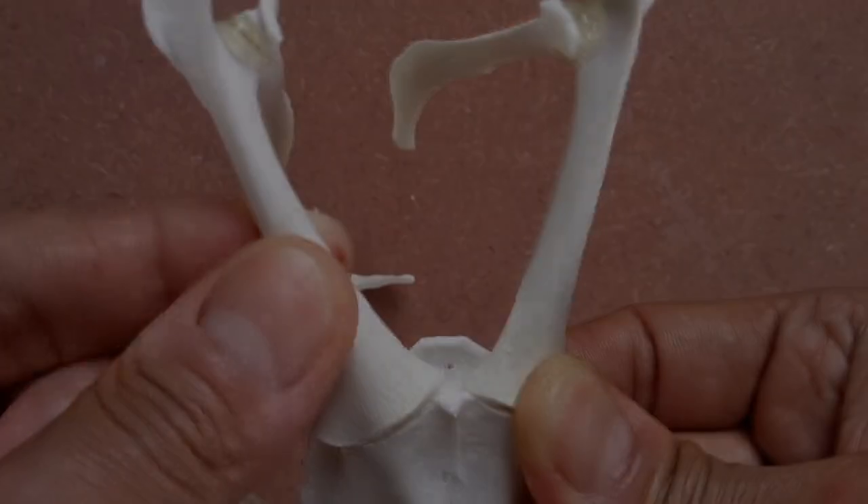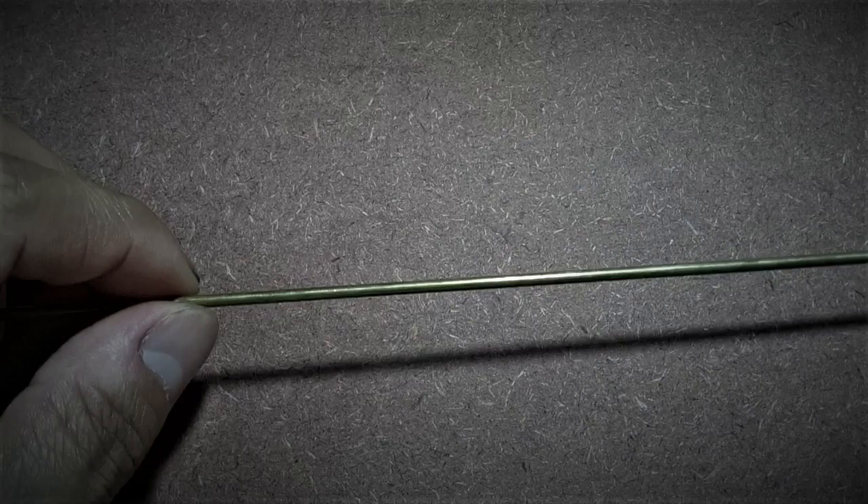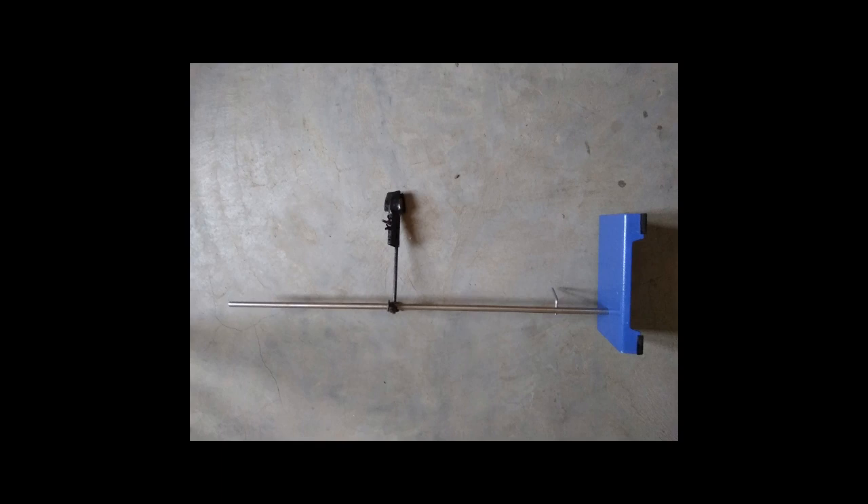For this video series on articulation, you're gonna need a hot glue gun with glue sticks, forceps, a sturdy metal rod, permanent marker pen, clamp and stand, or any other support that's available at your disposal. So let's begin with the skull articulation.